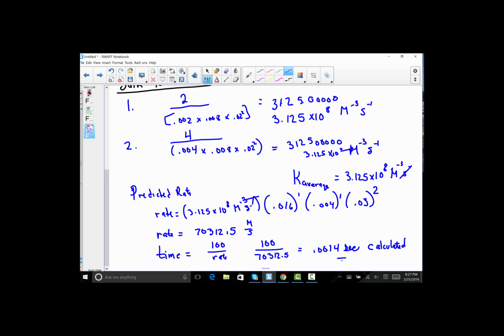And secondly, we had difficulty getting the solution to turn blue with consistency because the number of starch drops influenced the rate. So you could not vary the number of starch drops, and some students were doing that. I had to use 1 drop or 2 drops or 3 drops consistently, and if I used different size drops or different numbers of drops, I saw inconsistency in the data as well.